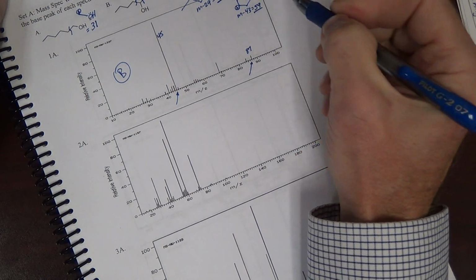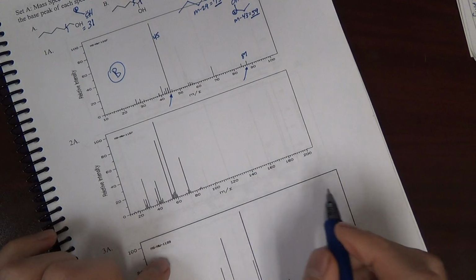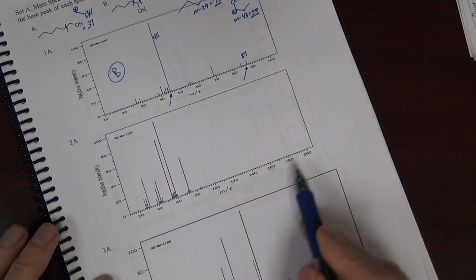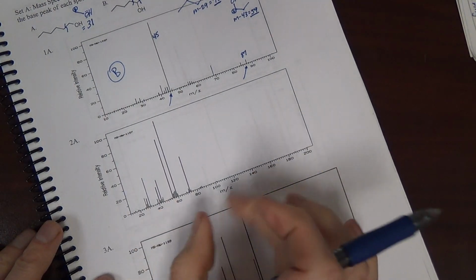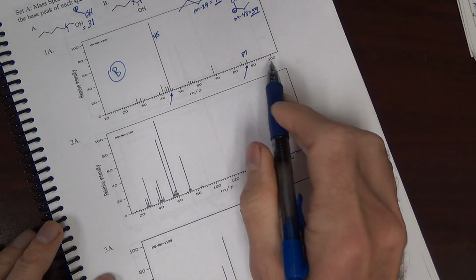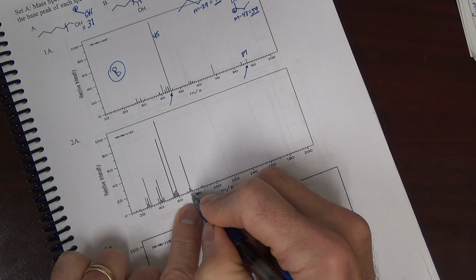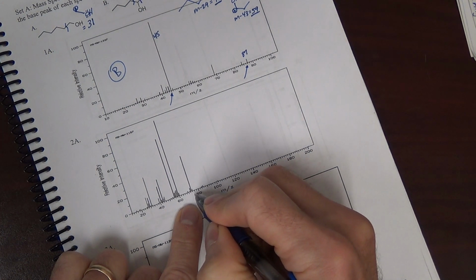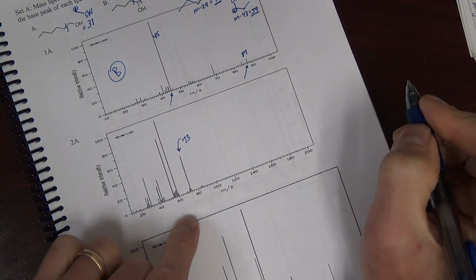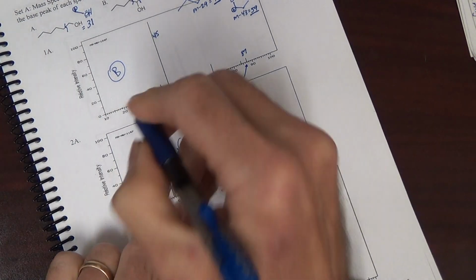73 and 59. What do we have here? The scale of this mass spec is a little different. It's more condensed, going from 0 to 200, where these others go from 0 to 100. This is 72, 74, 76, 78, 80, 73. That's 73 right there. Do I have a 59? Well, yes. Right there is 59.